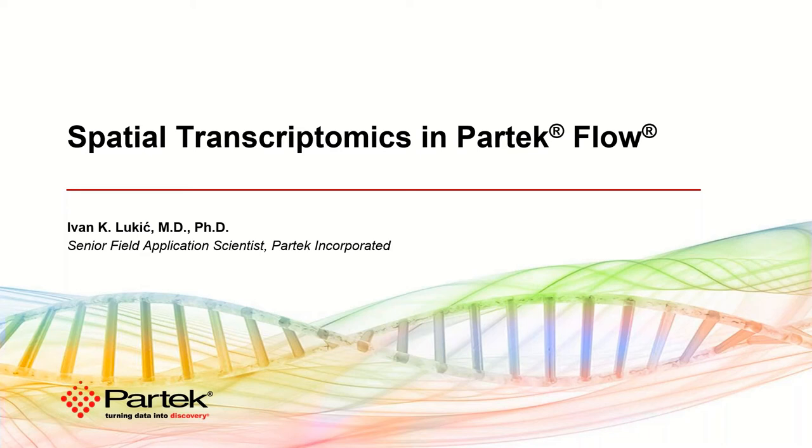I will start with a brief introduction to Partek. After that, I will give an overview of Partek Flow, our analysis solution for multiomics, and then switch to the main part of this session, which is actually data analysis.